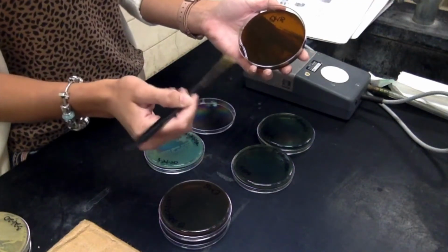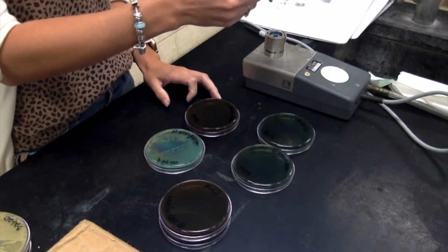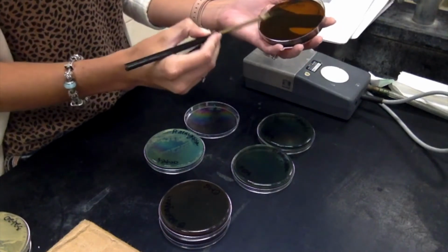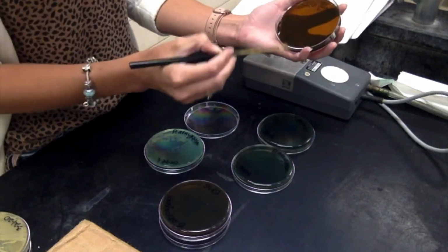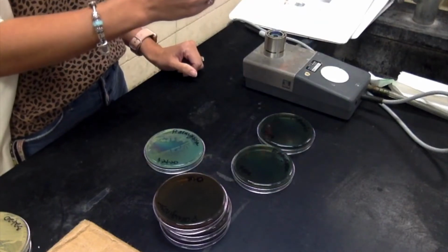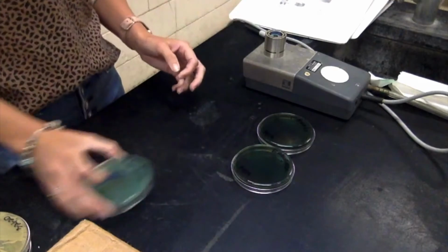Now, if you notice, the media is already kind of like a purple color. So that's why I say the same color as the media, because a lot of times people will look at it and say, well, the colonies look purple to me. Well, they look purple because the media already kind of has a purple color to it. And when you see how purple the E. coli and the Enterobacter is going to be, you're going to understand what I mean.